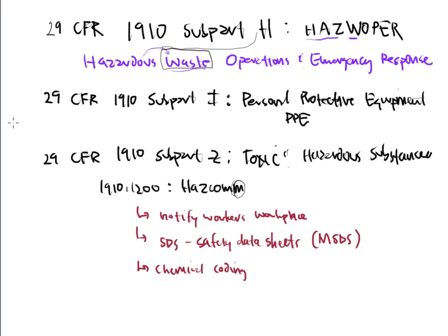Okay, so that is all Hazcom, part of 1910 Subpart Z. But if we want to hone in, because there's a lot of verbiage and a lot of different sections in that kind of chapter, we need to go to part 1200 to look for Hazcom. All right. I also want to mention that there's entire courses built around Hazcom in certain laboratories. So you can be Hazcom certified. You can take these courses. You can get certificates and you can get training on them. But Hazcom is a pretty important one that's out there.